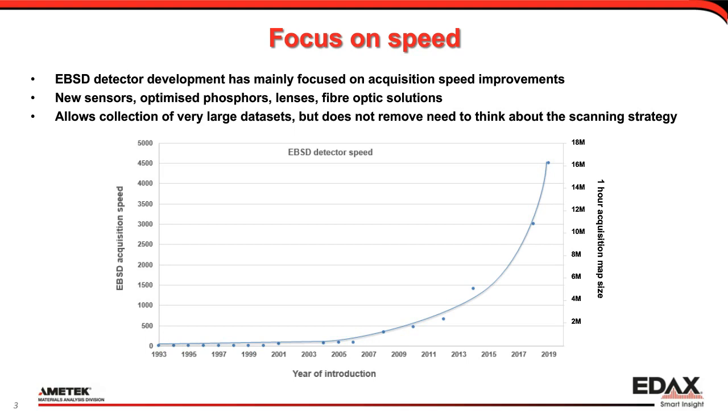And at some point, you need to think, how practical is it what I'm doing? You can get fantastic maps, but you still have to process them. So you still need to think very carefully about scanning strategy.